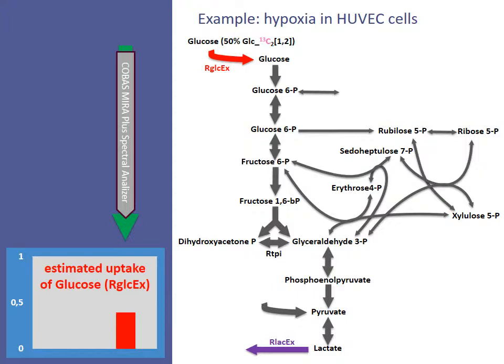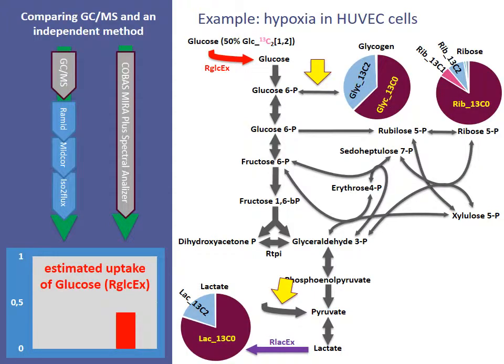Considering that glycolysis and pentose phosphate pathways are accompanied by alternative inputs, glycogen utilization, and an extra input of pyruvate, and taking into account that all fluxes have unconstrained values, applying mass spectrometry, a similar estimation will be obtained. The answer will be provided by running our workflow for fluxomics.